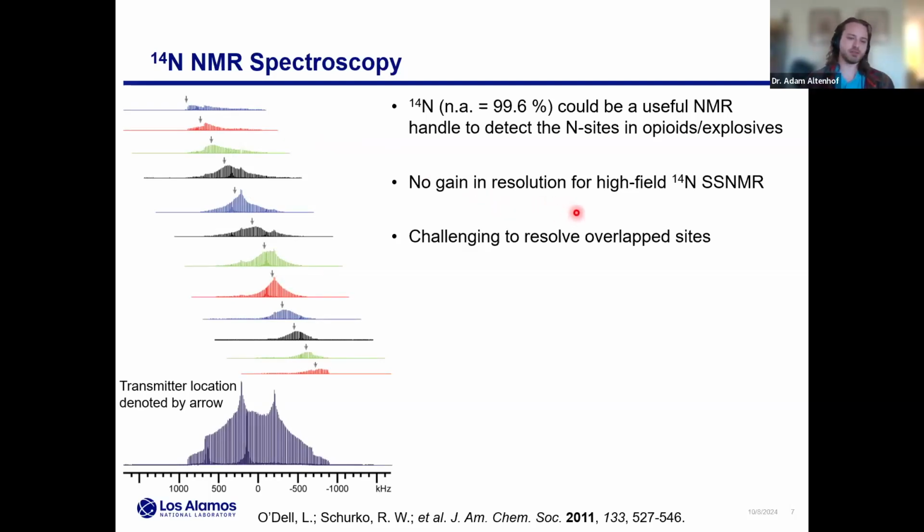Now, in the context of high field 14N solid state NMR, there's no resolution gain to go to higher and higher fields. If you haven't seen this before, this is basically your average 14N powder pattern spectrum. It's spanning nearly 2 megahertz in this case. If I draw this band here, that band is going to represent, say, my entire proton chemical shift range, carbon chemical shift range. Really, most chemical shift ranges in hertz would fit in that box. So we're talking about an insanely broad spectrum, inherently quite low in resolution. And again, this is a single nitrogen site in an average small molecule.